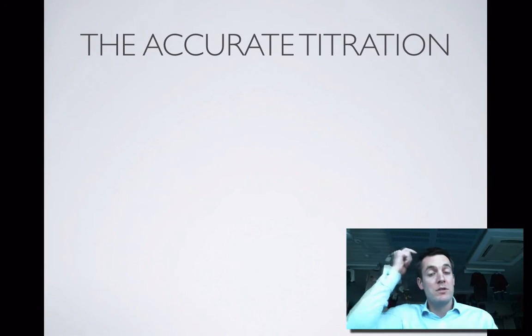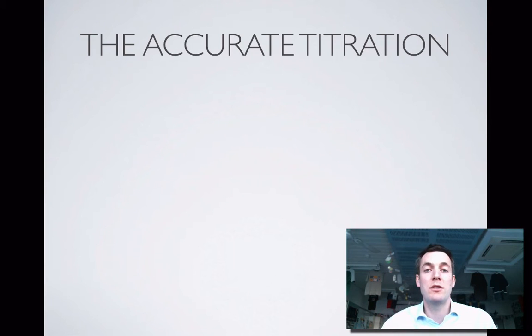Now once you've got some results from a rough titration, it's time to do some accurate titration. So in other words, we're going to do the titration to try and get a volume that is correct to within 0.05 of a milliliter if possible. So we're going to go for two decimal places on our burette, although our last decimal place is only probably going to be a 0 or a 5 because you can't really see well enough to do it more accurately than that.